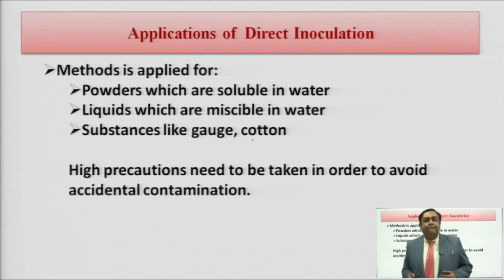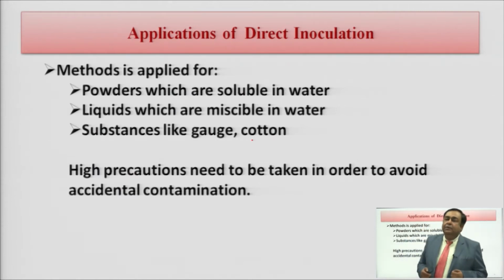Now, let us see where these direct inoculation techniques are commonly used. Direct inoculation techniques are used for powders which are water soluble in nature.